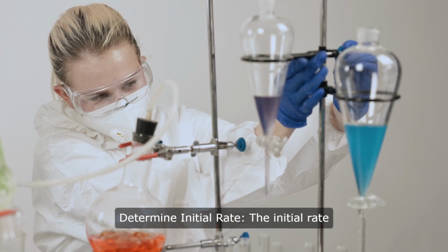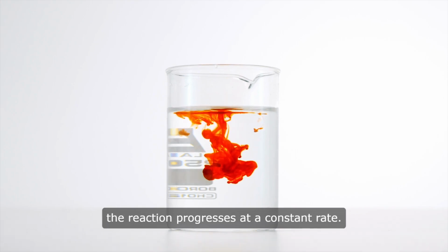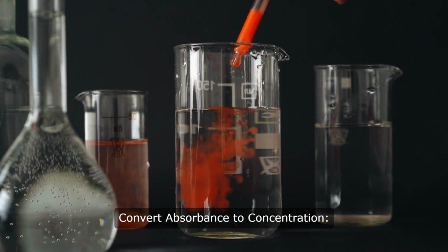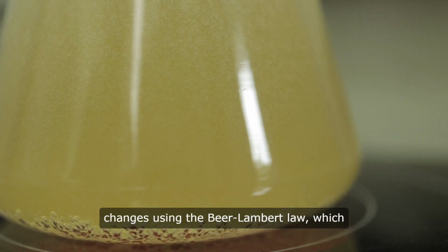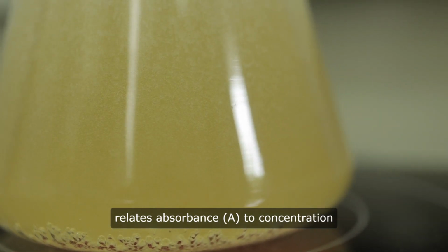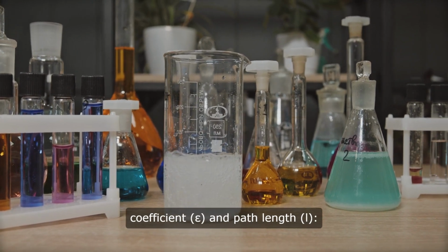Determine initial rate. The initial rate of reaction is the slope of the reaction curve during the early linear phase, where the reaction progresses at a constant rate. Convert absorbance to concentration. If needed, convert absorbance changes to concentration changes using the Beer-Lambert law, which relates absorbance, A, to concentration, C, through the molar extinction coefficient, ε, and path length, L.